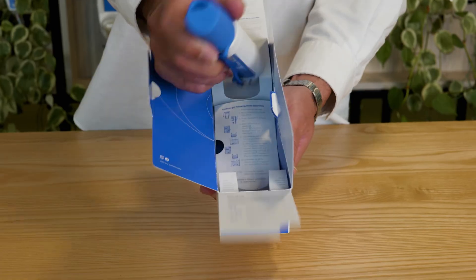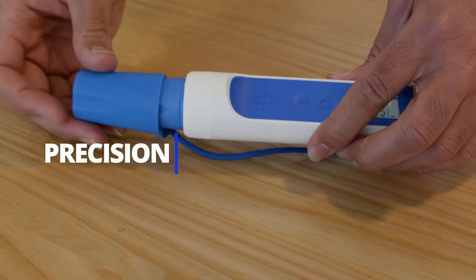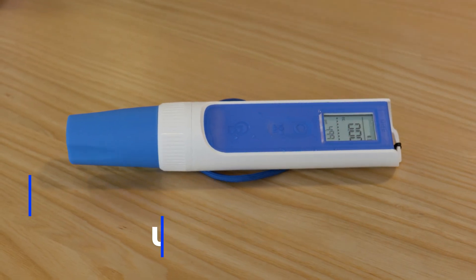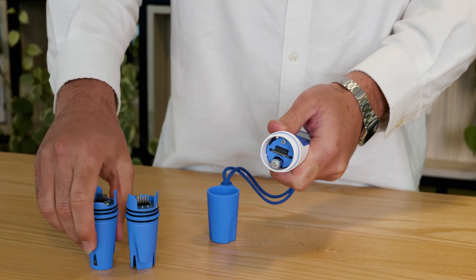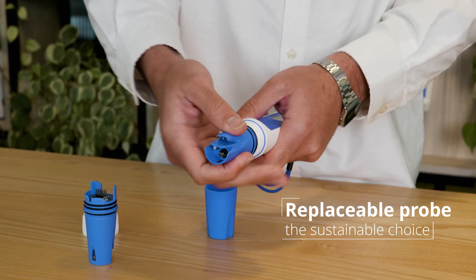The One Pen takes measurement pens for growers to a whole new level. We've obsessed over every detail to ensure optimal precision, durability and user experience. The replaceable probe is a game changer. It not only saves you money but it reduces waste, making it a sustainable choice.